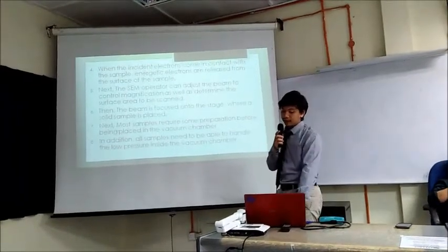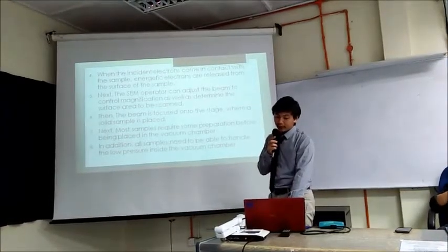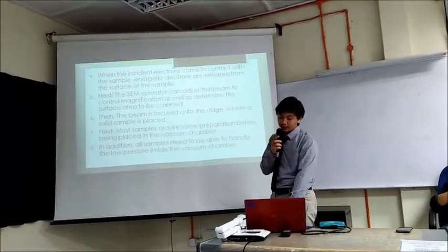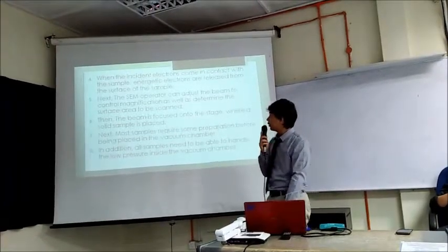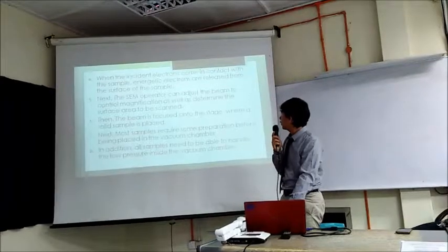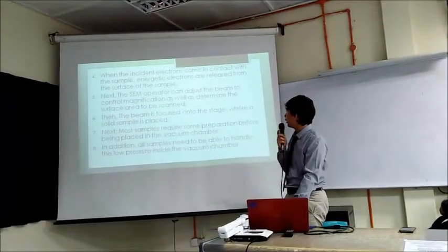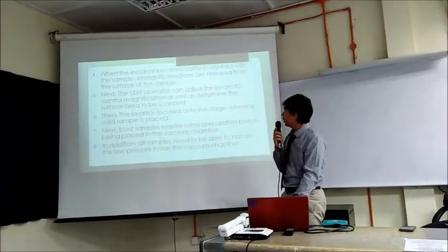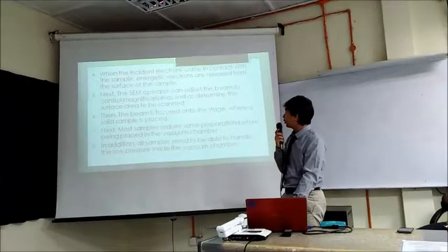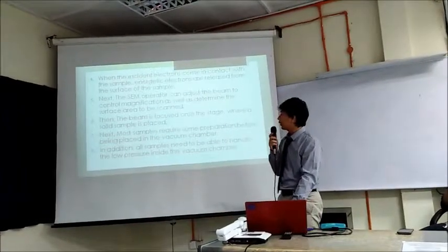Then, when the incident electrons come in contact with the sample, energetic electrons are released from the surface of the sample. Next, the SEM operator can adjust the beam to control magnification as well as determine the surface area to be scanned. Then the beam is focused onto the stage where a solid sample is placed.